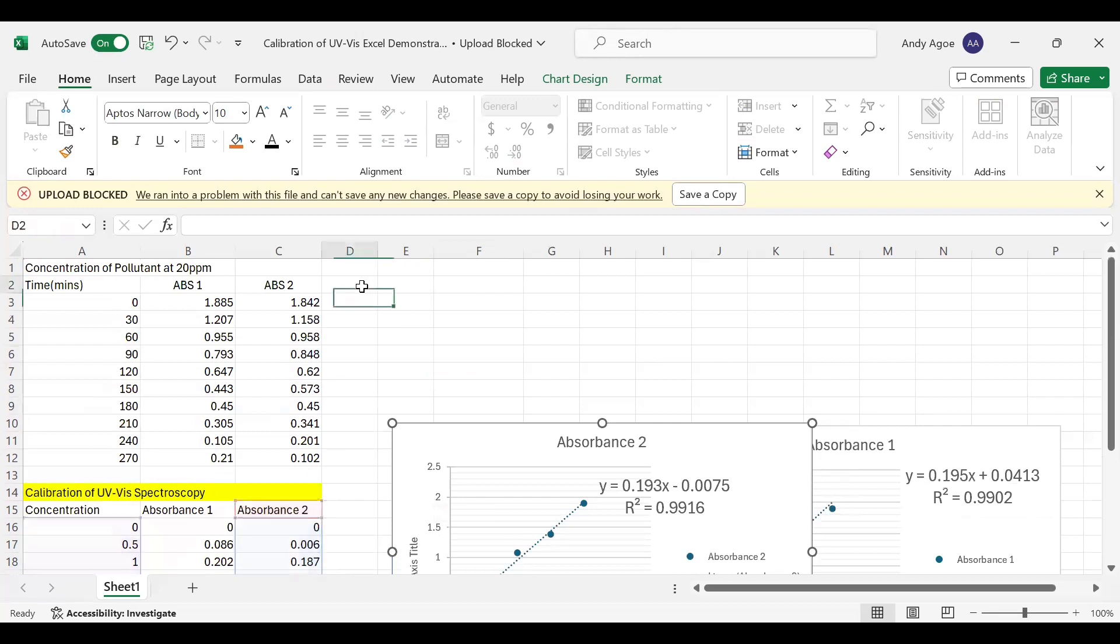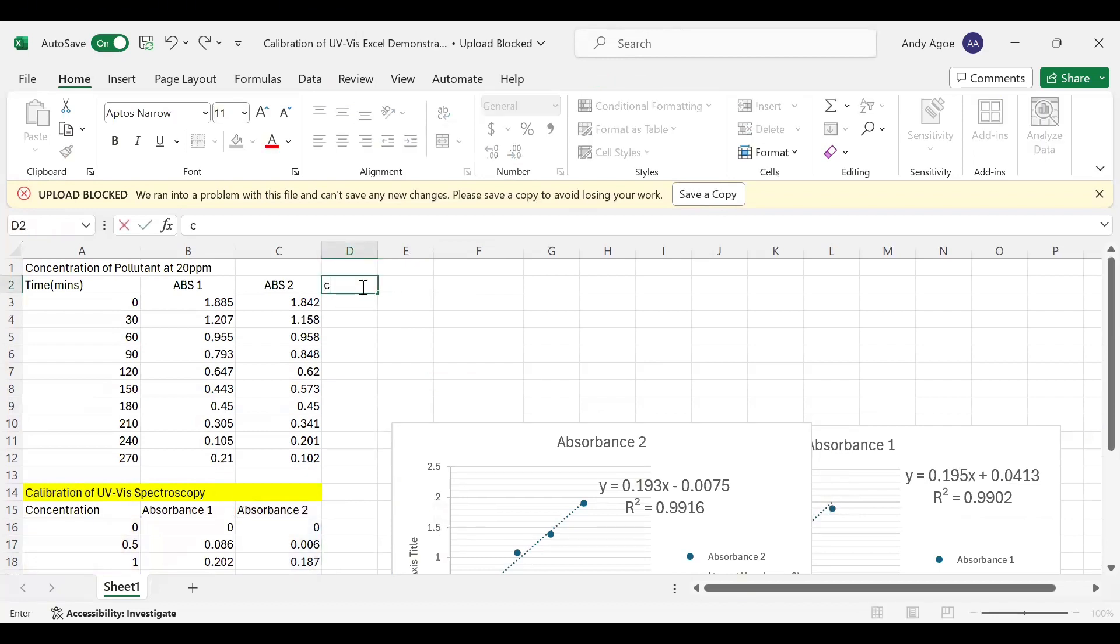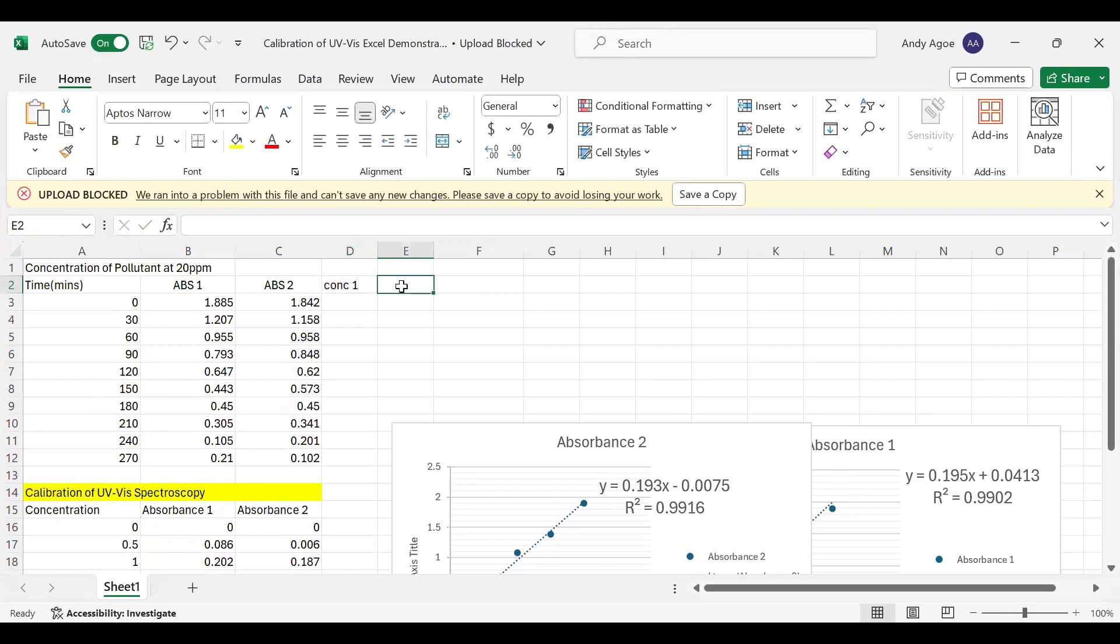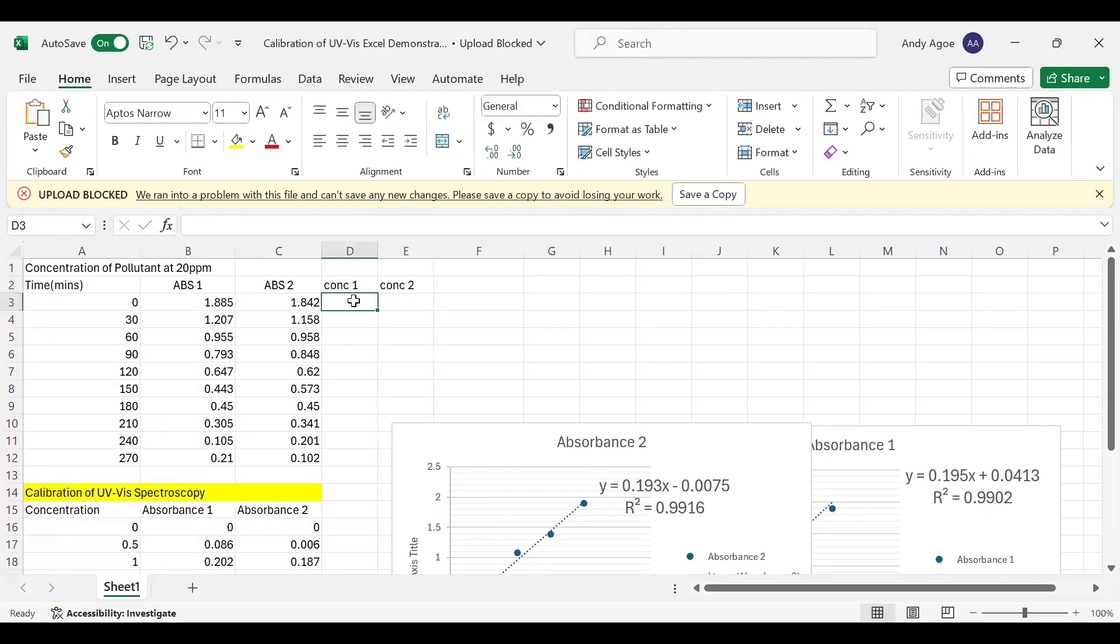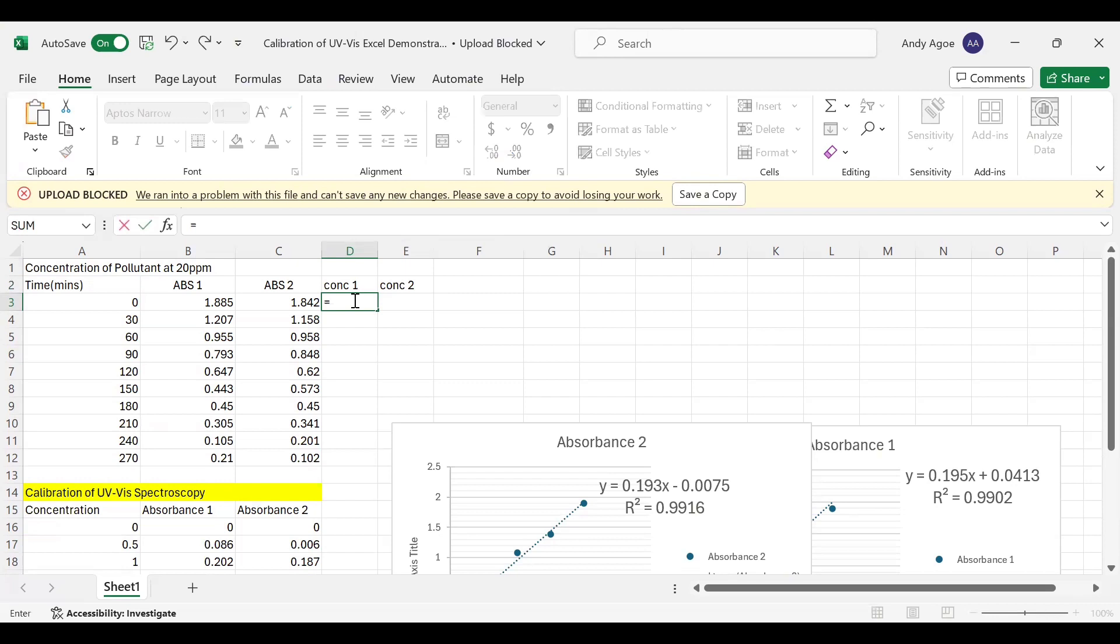Let us create a new column named Concentration 1 and Concentration 2. Since we want to make the system a function, you begin with an equal sign. Then you bring your open bracket. Then now you select Absorbance 1. You move to your equation of a line for Absorbance 1. With the equation, we are trying to make X the subject.